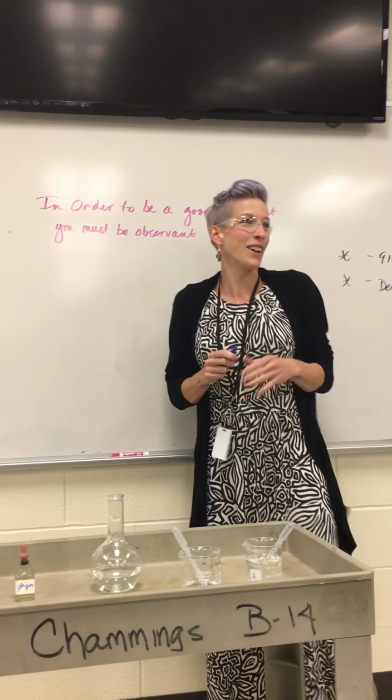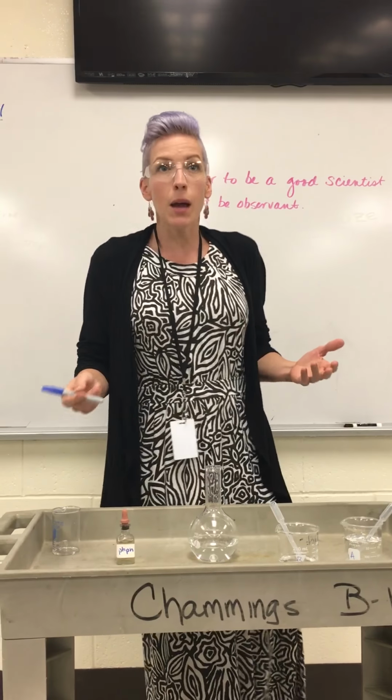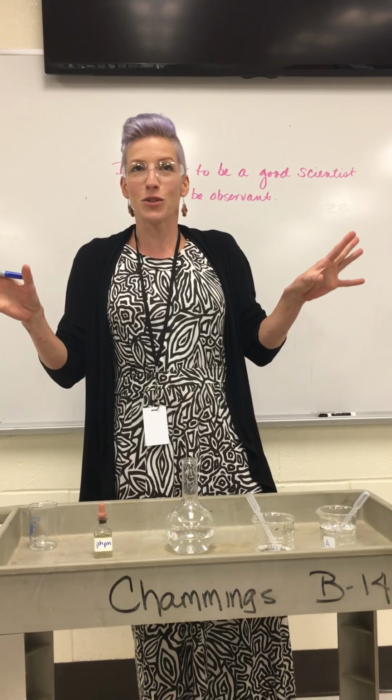Oh, you're just standing there. Okay. I didn't know if you needed anything. Okay. So, for example, if anybody wants to come closer, this is not as dangerous as the last one.